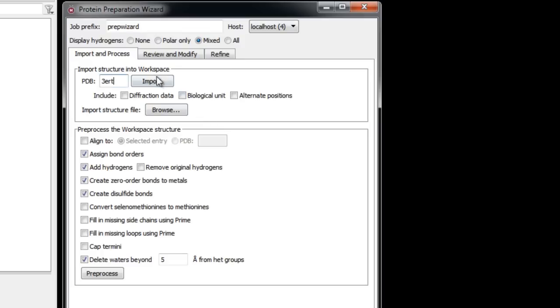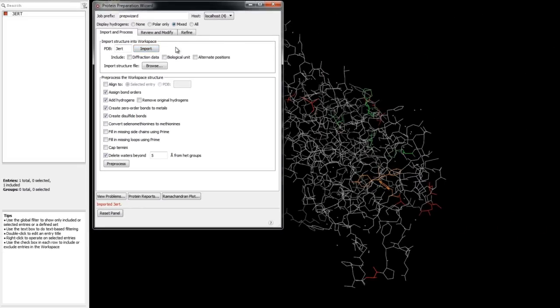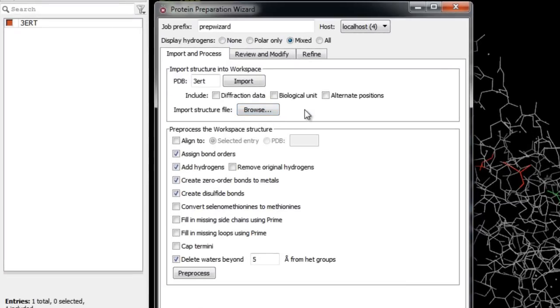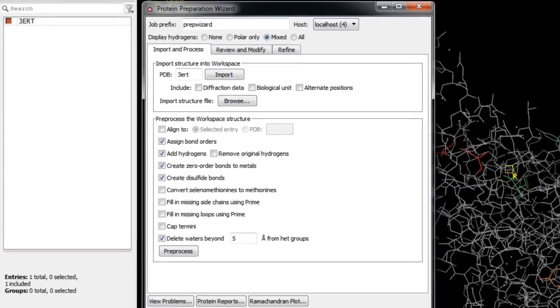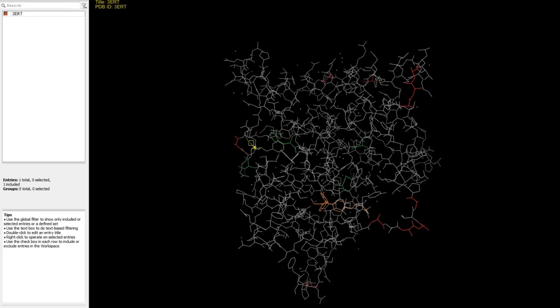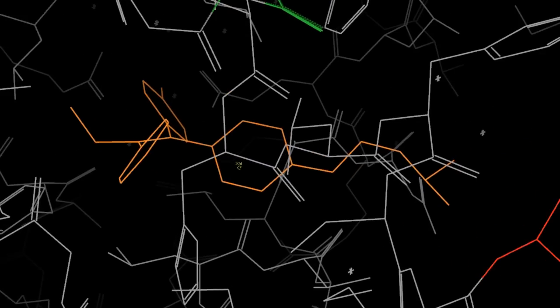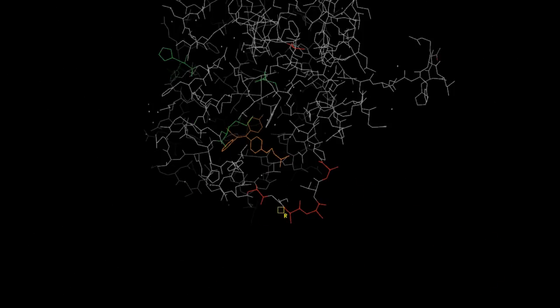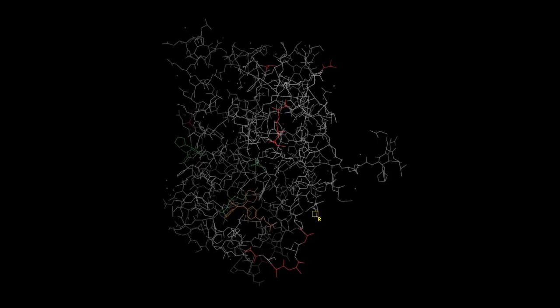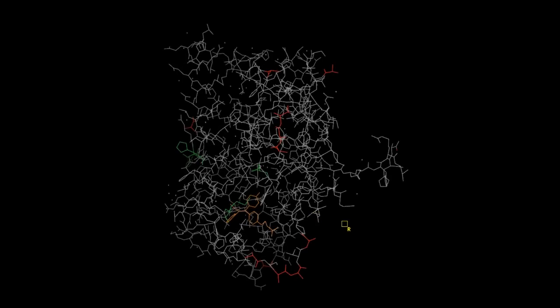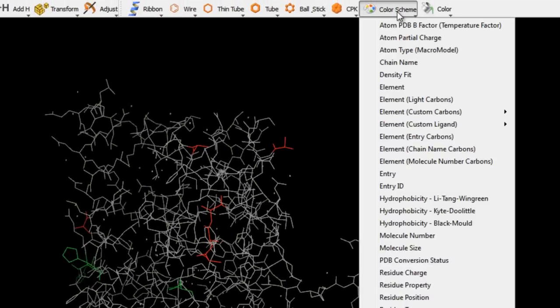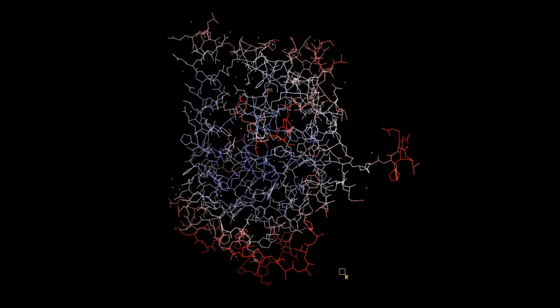The PDB file is either downloaded automatically from the RCSB website or retrieved from any local PDB installation. Once imported, the structure appears in the entry list and workspace colored by PDB conversion status — a color-based error reporting scheme. Orange indicates non-standard residues or het groups. Red shows a standard residue with missing atoms; right-clicking reveals it is a lysine with sidechain atoms missing. Missing atoms are often seen in highly mobile regions with high B-factors, which we can confirm by changing the color scheme to atom PDB B-factor.